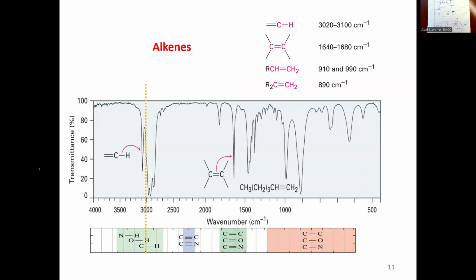This one is how you see alkenes, they are saving time here. In the case of alkenes, of course, if you see the CHs, remember, what you see is the CH. But if there is a CH sp2, that means that it's a double bond here, right? So that C double C is seen somewhere around 1600. Okay, so where do I find that?